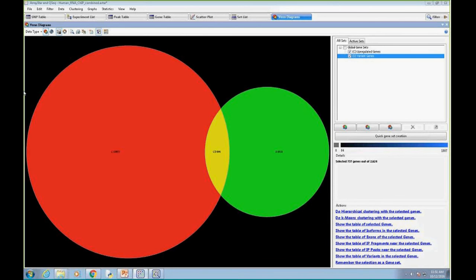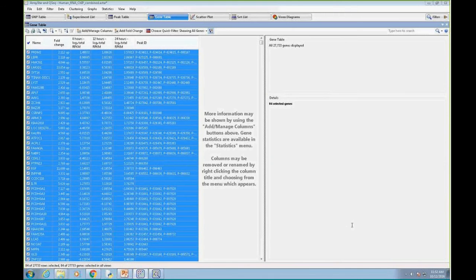done this exact filter. And I can do something like a Venn diagram and say, well, there's a subset here where the genes are upregulated and they also have a damaging SNP, which probably, you want to see downregulated more, but I could go back and do different kinds of combinations and then compare the different sets to look for sets that are unique to each group or common. And then again, I can, in a Venn diagram, select the intersection and do all different types of analysis just on that subset. So here's the subset of those genes that meet that criteria.